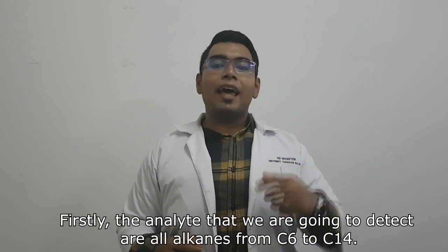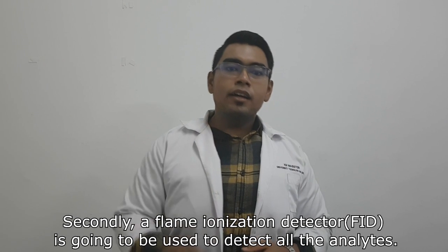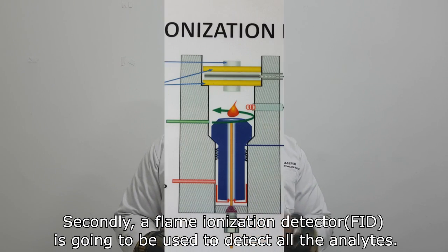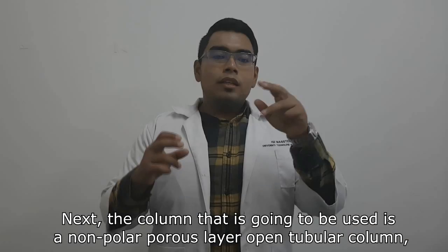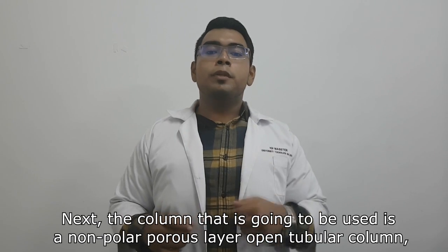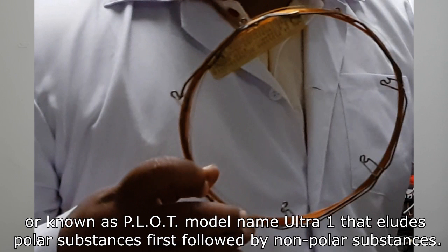Firstly, the analytes that we are going to detect are all alkanes from C6 to C14. Secondly, a flame ionization detector, also known as FID, is going to be used to detect all the analytes. Next, the column that is going to be used is a non-polar porous layer open tubular column, also known as PLOT, model name Ultra 1, that elutes polar substances first, followed by non-polar substances.